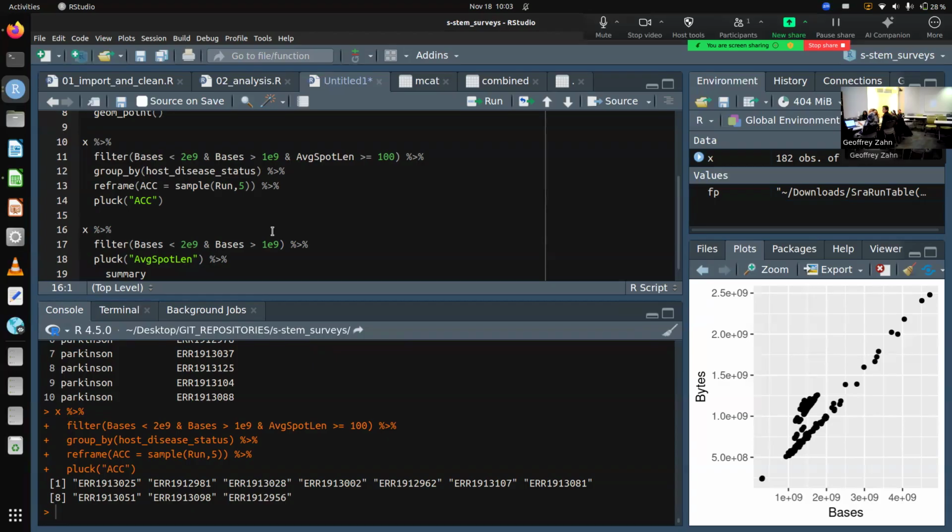We're randomly choosing 5 patients from each. We're going to run our pipeline on all 10 of those. And then at the end, in our output table, we can look and see statistical differences between gene, not expression, but gene presence in the gut. See if there's a difference between Parkinson's.